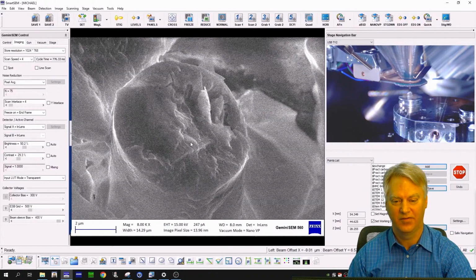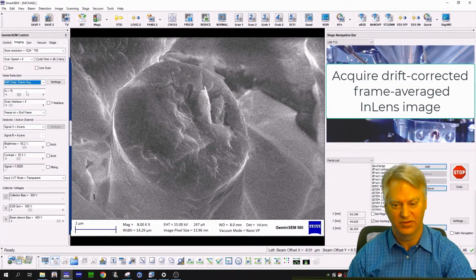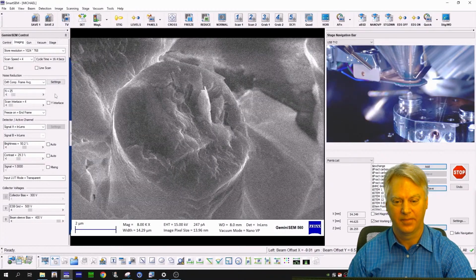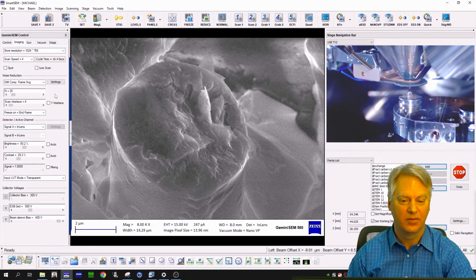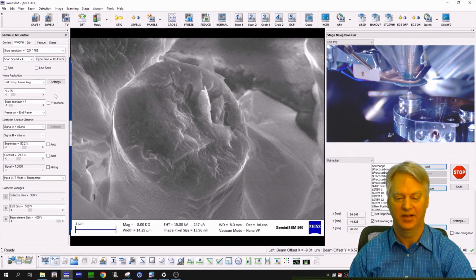We see really nice surface information. It's very surface topography and other things that we can see that are really nice. So it's looking nice. That's good complementary information to the C2D and the BSD images that we get.